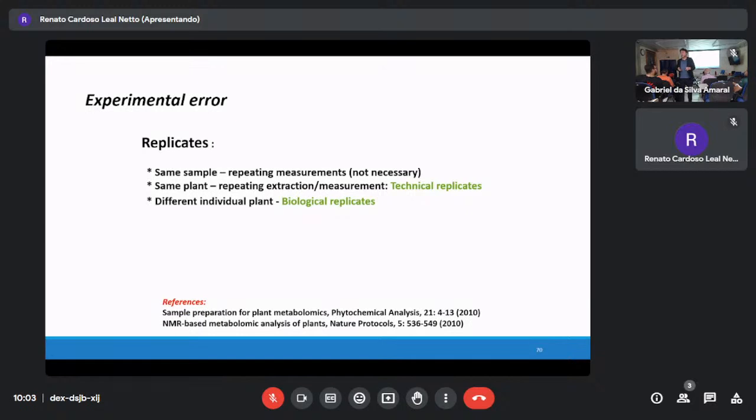Quality control sample means now you have 10 kinds of sample, yeah? 10 kinds of sample, I mixed them up together to prepare a QC sample. The easiest way is to extract it several times, then it's included in your final answer. This is a QC sample.